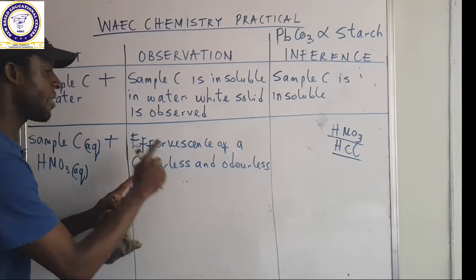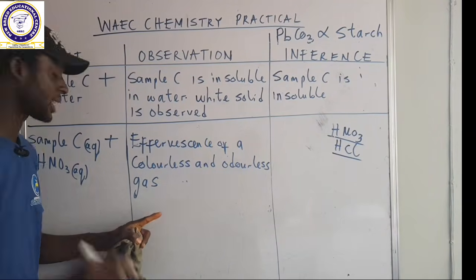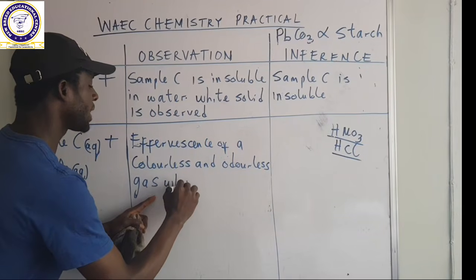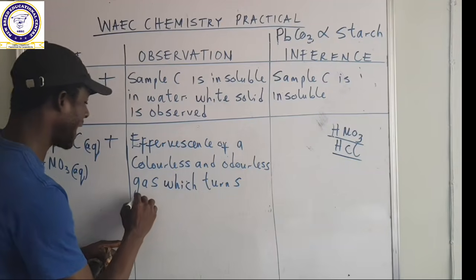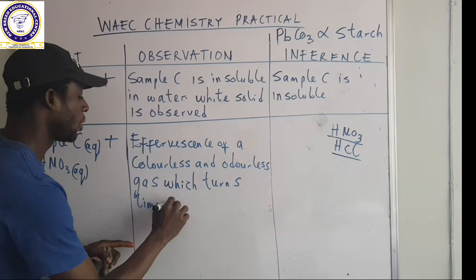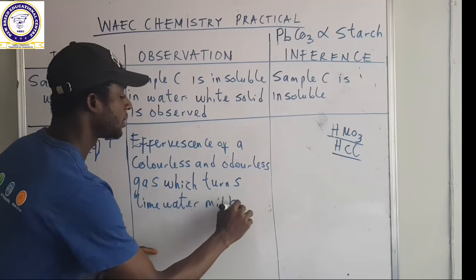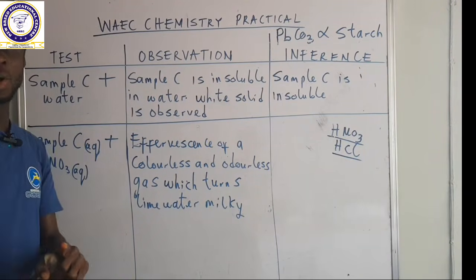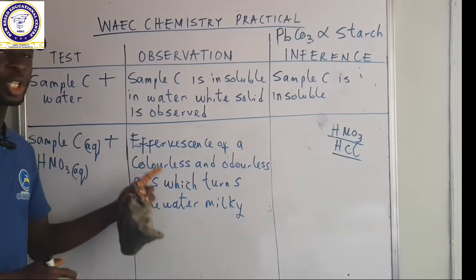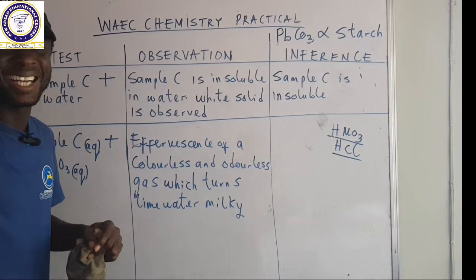Effervescence of a colourless and odourless gas, which, if you pass it through lime water, turns lime water milky. It's also an acidic gas. Your CO2 is an acidic gas.